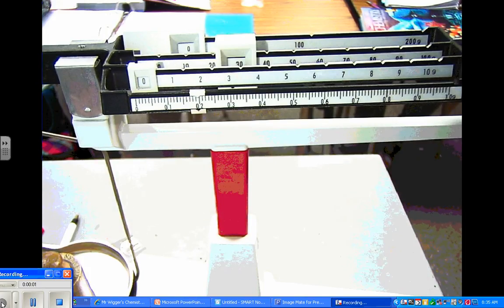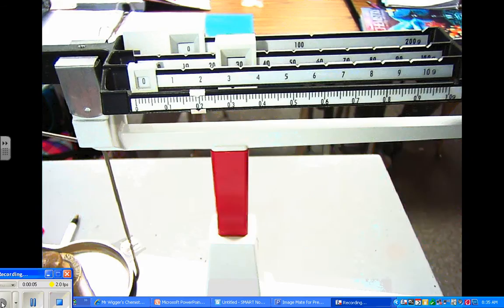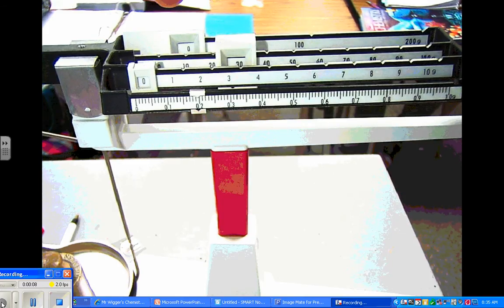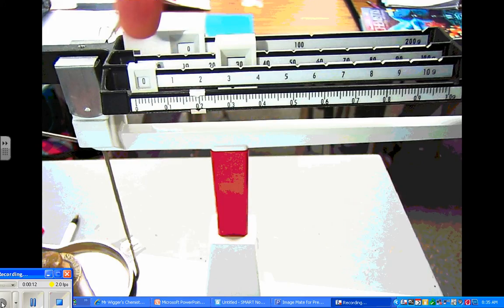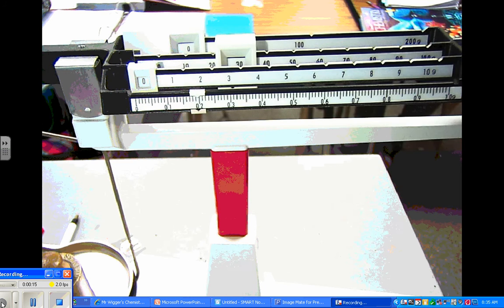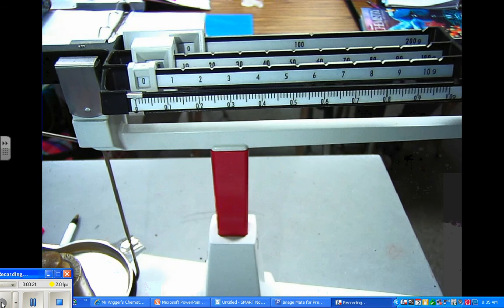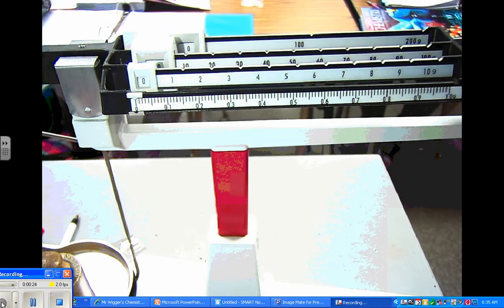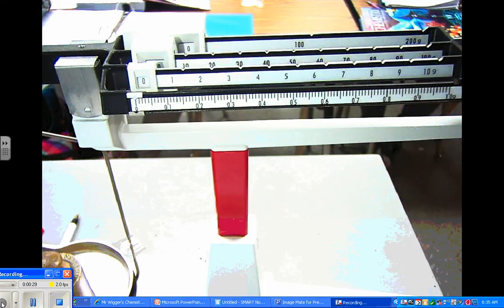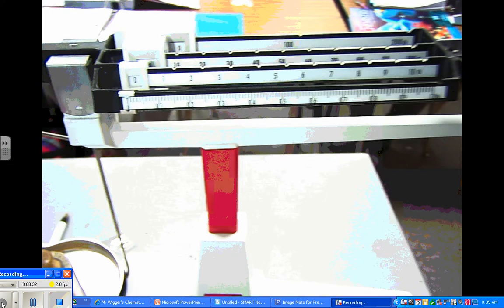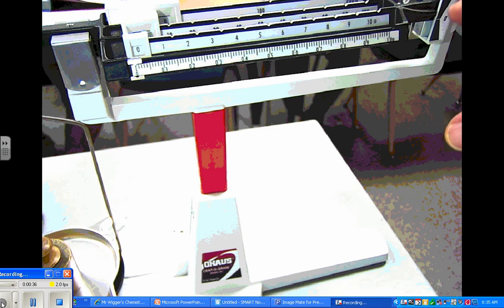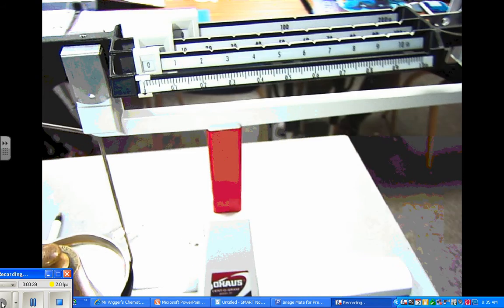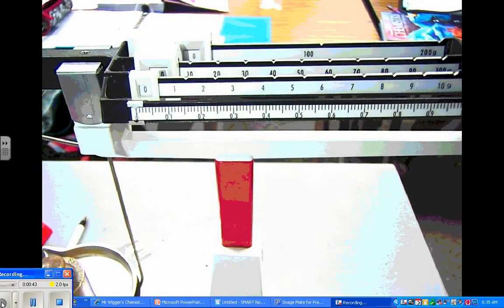Reading of a four beam balance. The way this works is we have to read mass from one, two, three, four different sliders. When you start out weighing anything, you want to have all your sliders all the way over to the left. The reason you want to do that is so you can make sure your balance is actually balanced. I'm not going to be actually balancing anything. I'm just going to move sliders to show you how to read them.